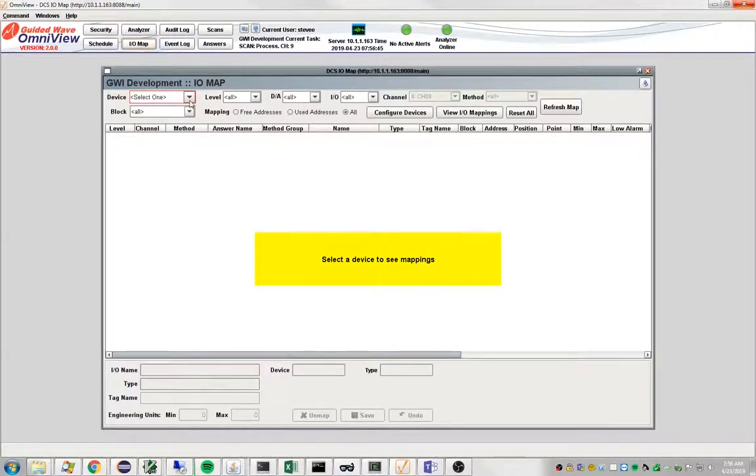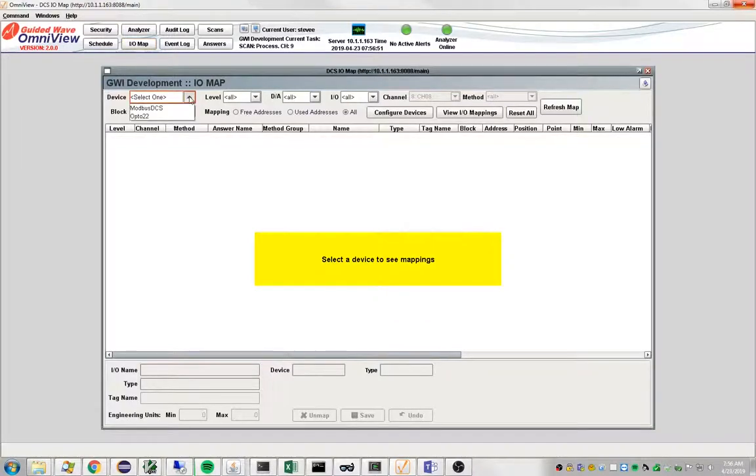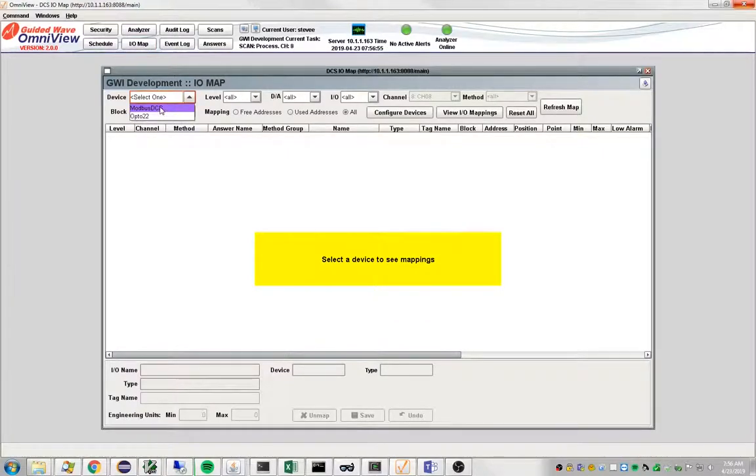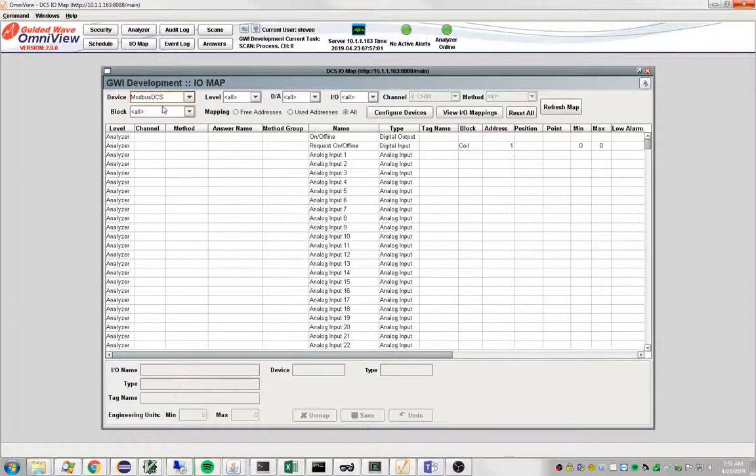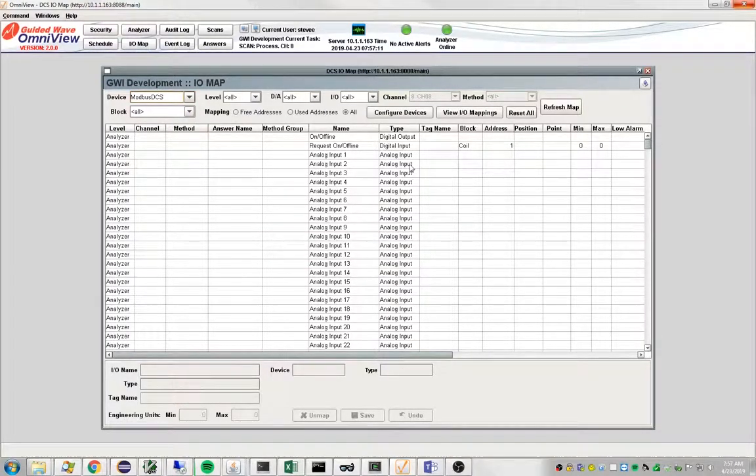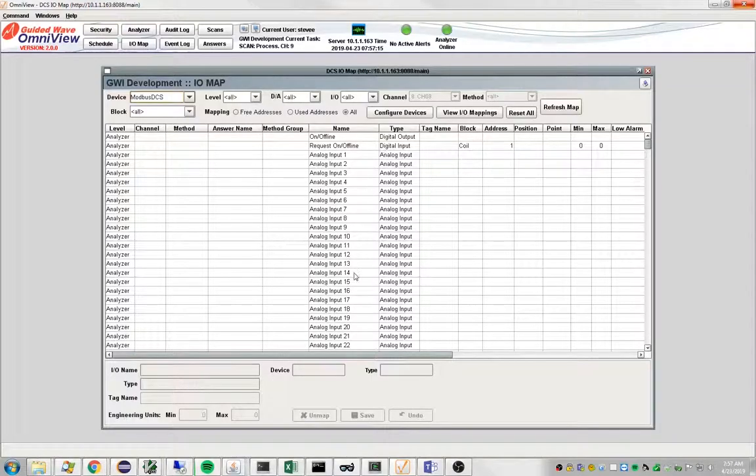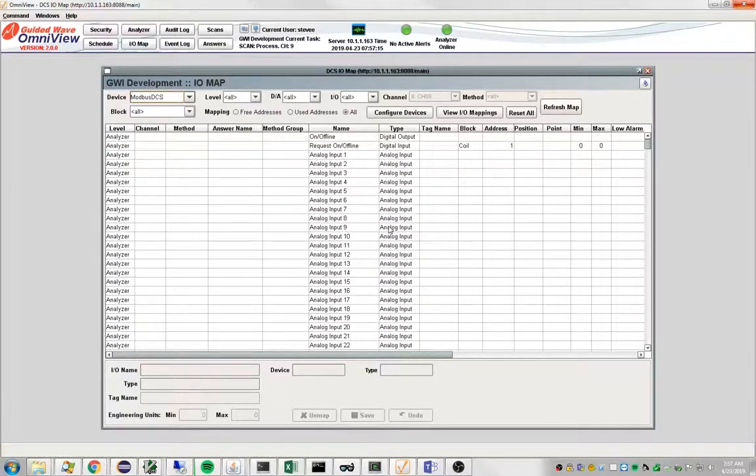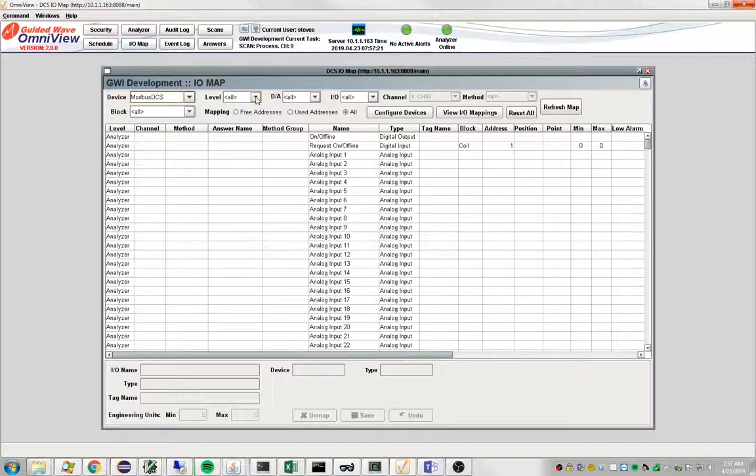So let's say we want to write one of these methods out to a Modbus DCS. This is a digital DCS device. So we'll select it and it brings up the entire map. These are all the potential things that can be mapped to a DCS device. What we're interested in are methods.